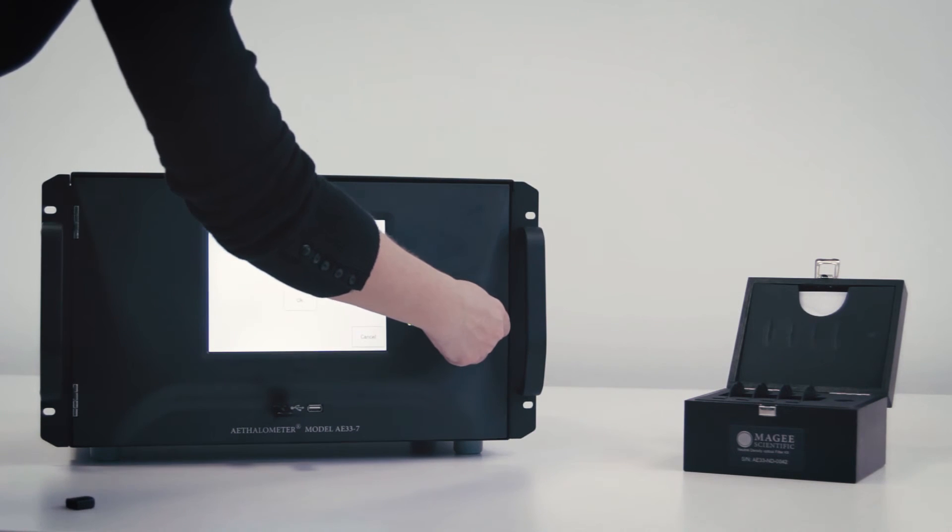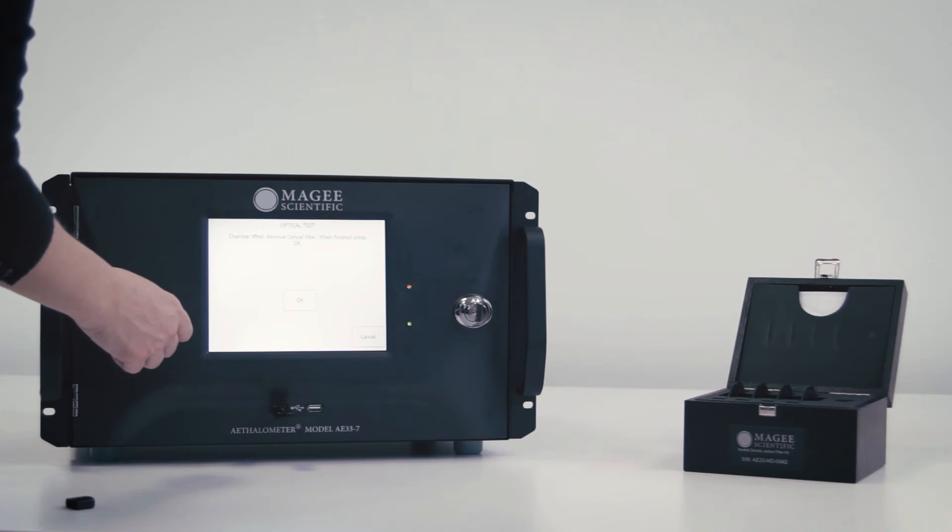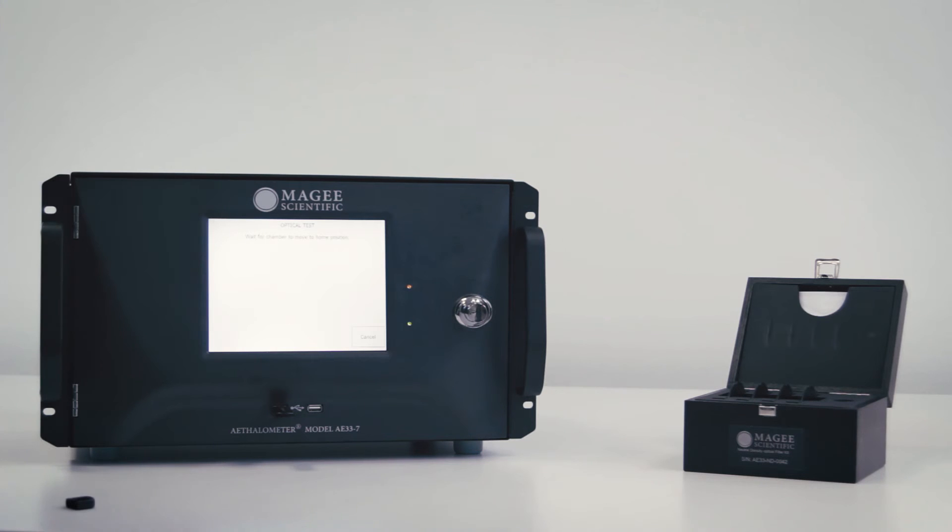Press OK to allow the chamber to return to its base position. The test is now completed. The report shows information about the test: instrument serial number, date and time of the test, and the results of the test.